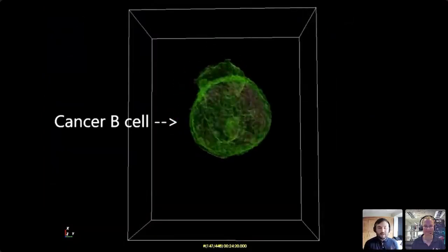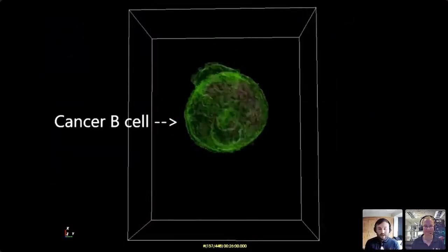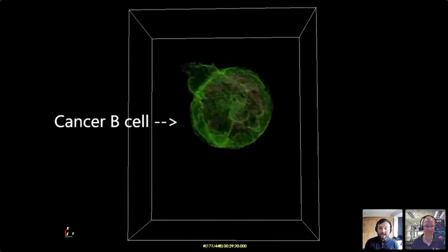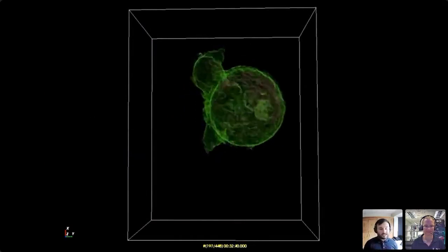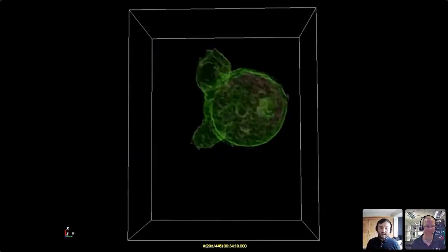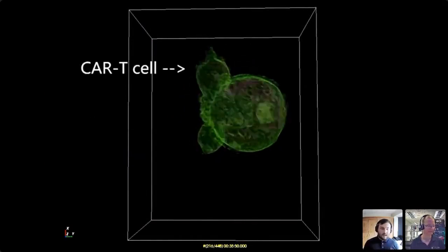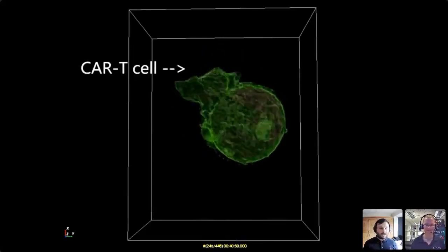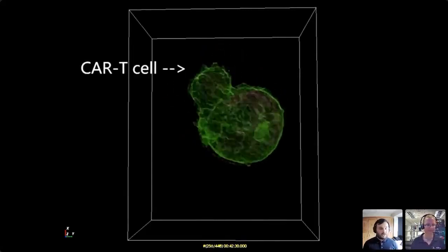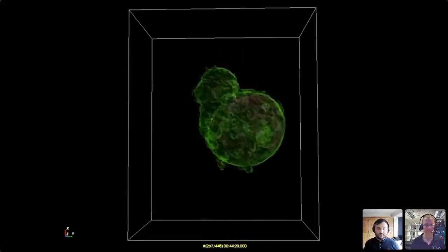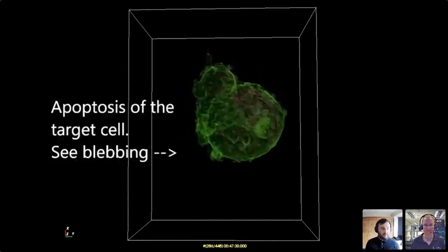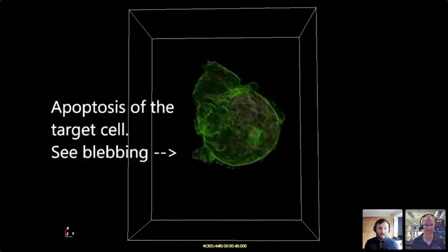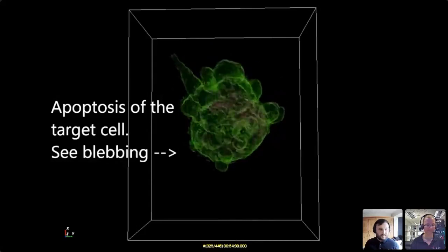One exciting assay explored in a label-free setting on the HT2H is the CAR T cell assay. Here we can observe the interaction of the CAR T cell inducing apoptosis in a cancer B cell, and we can see the blebbing of the cancer cell as it happens.